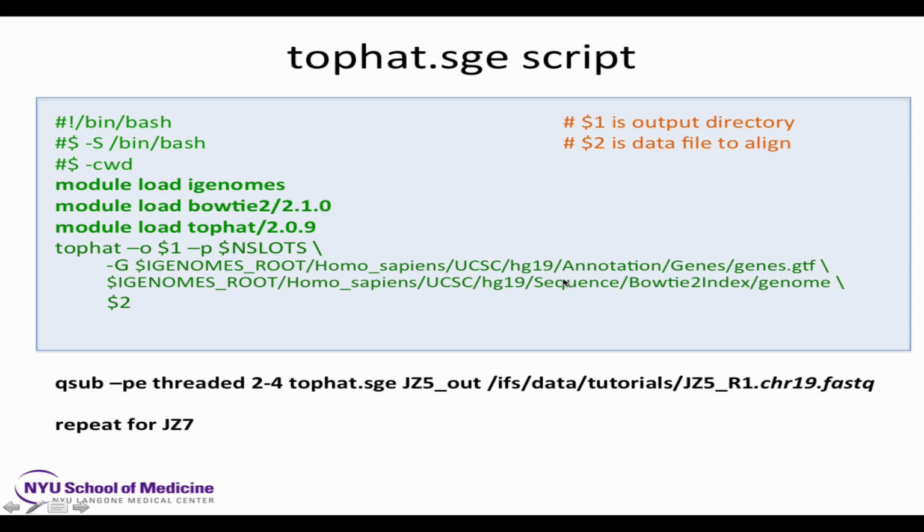There's another option called -g, which says use the reference genome and also learn new splice isoforms. So that's a little slower, but it does give you more expression for certain transcripts that fall outside of the known genome annotation. If you've spent any time in transcriptomics, you know that there are alternate upstream start sites, alternate downstream transcript termination sites, and you'll accumulate more reads associated with each sample.